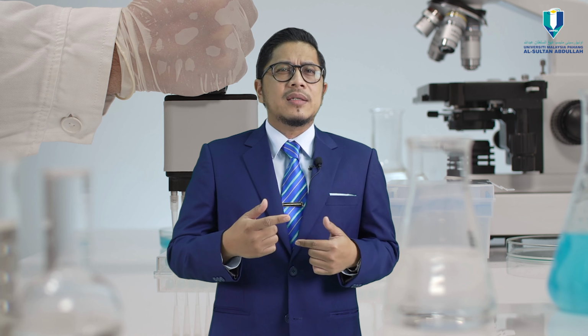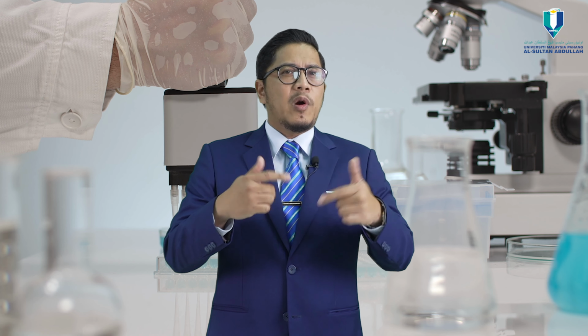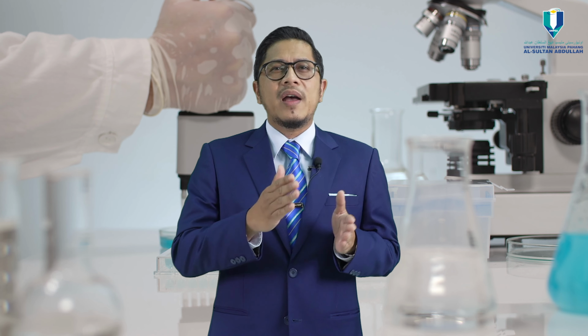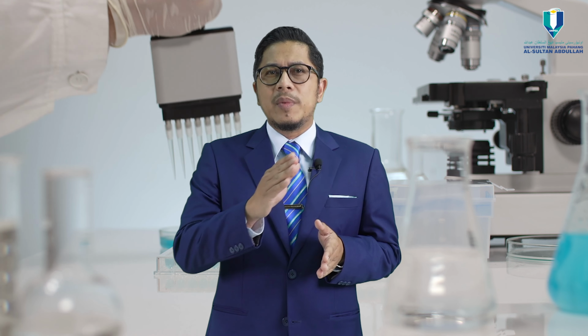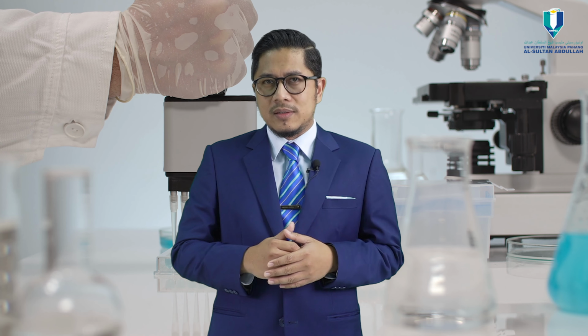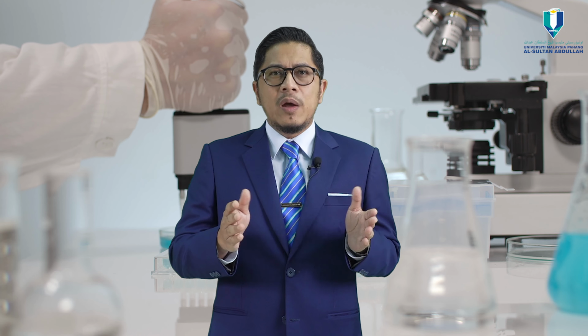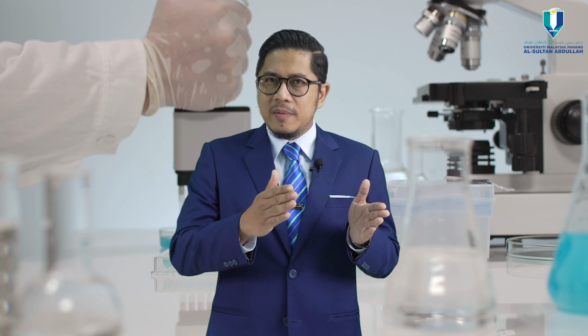Now let's discuss how to load samples effectively. Proper sample preparation is crucial for accurate results. Samples should be finely powdered to ensure that all regions of the material are represented in the analysis. This powder is then carefully packed into a sample holder or sample stage. The sample holder must be made of a material that does not interfere with the X-ray diffraction, often using materials like glass or quartz. It should securely hold the sample in place and allow for precise positioning.